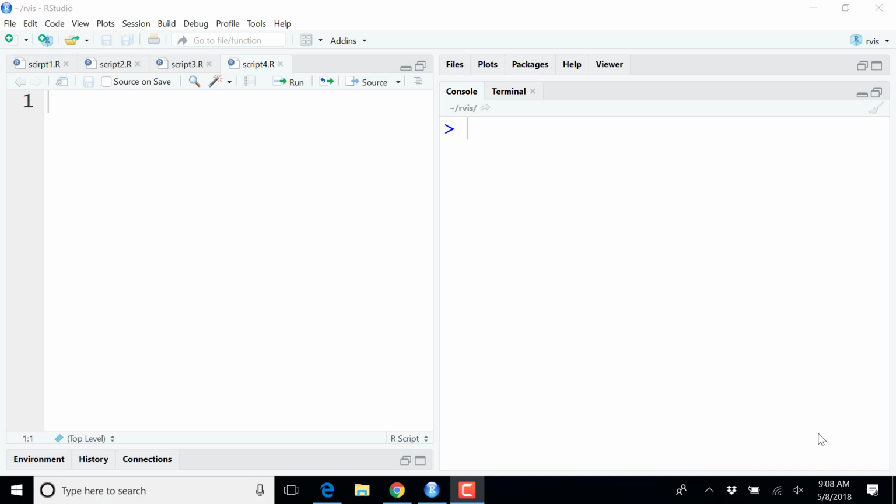For this I expect that you have a data directory at hand with all the data sets that we produced yesterday. If not, if you download the data.zip file, it contains all the pre-generated data sets. So to start with the transformations, we will need the IPRG3 data.